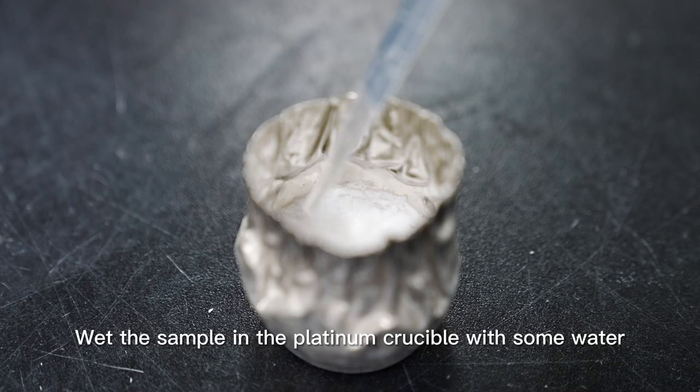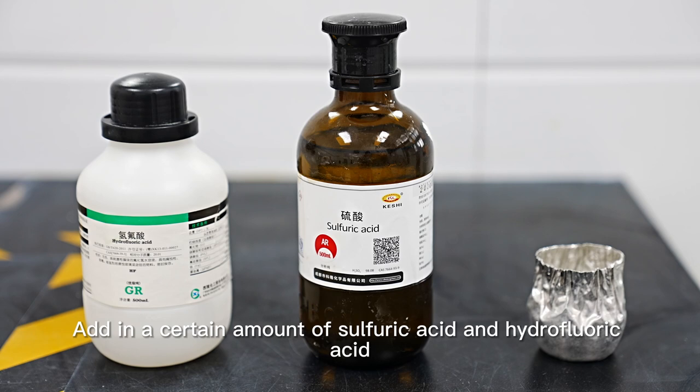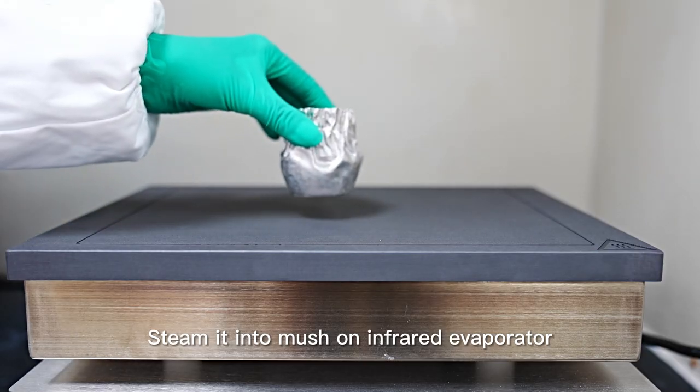Wet the sample in the platinum crucible with some water. Add in a certain amount of sulfuric acid and hydrofluoric acid. Steam it into mush on infrared evaporator.